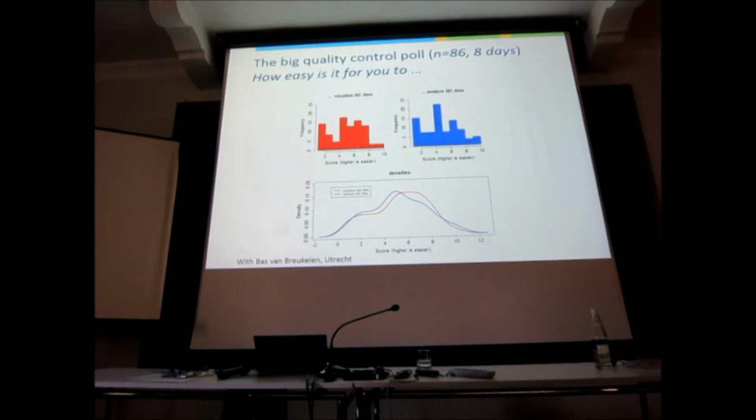So, another question is, how easy is it for you to look at QC data and to analyze QC data? And here you see a shift. You see that it's slightly easier to visualize than to analyze. Okay? Analyze means process the numbers. Visualize means make a few plots, look at some stuff. And a lot of vendor software allows you to look at some of the stuff, and some of the commercial software does as well. So people on average have an average feeling about how easy it is. But it's not easy enough. This should move to here, because then people would use it all the time.